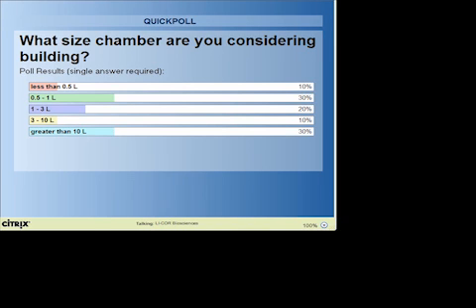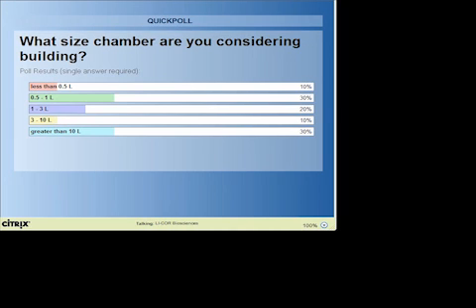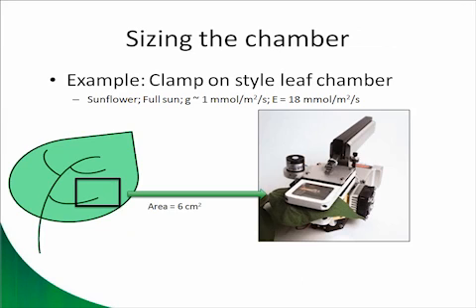As expected, we have seen a range in sizes, and there are several things that you need to consider, one of which is the rates that you're actually going to be measuring within your instrument, and Jason's going to speak to those considerations now. Well, now that we've seen the importance of chamber volume, let's talk a bit about sizing the chamber for the measurement that you're trying to make.